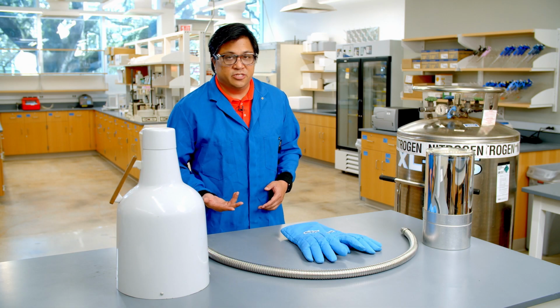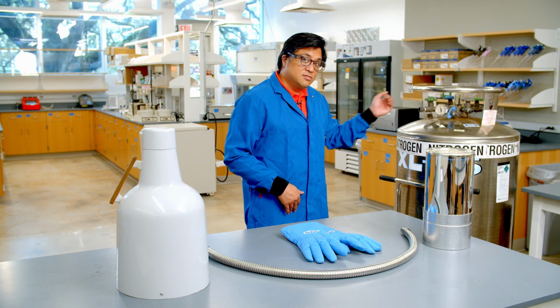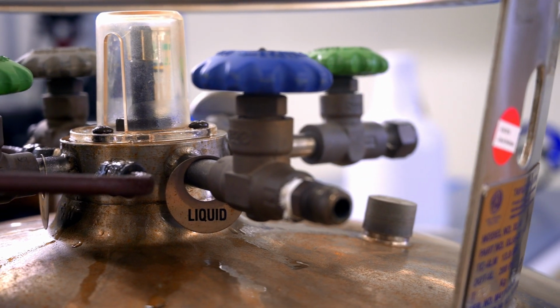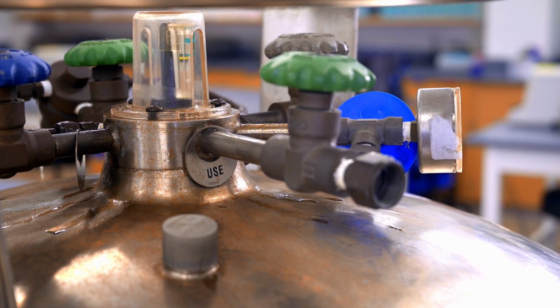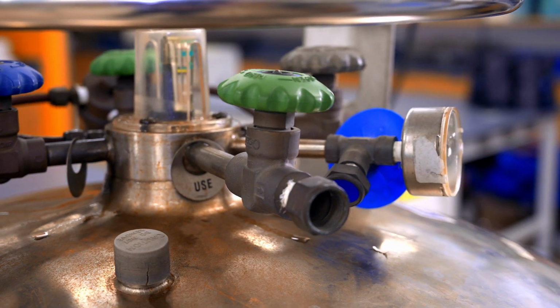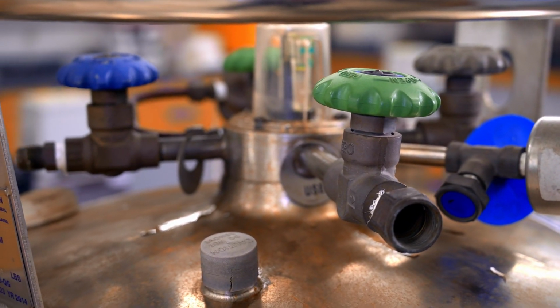Before using liquid nitrogen, take a moment to understand the equipment and the valves before drawing off your product. The liquid valve is used to dispense liquid nitrogen, which will be covered later in the video. The gas valve is used to draw vaporized gas from the dewar. It is advisable to use a pressure regulator when necessary to meter the pressure of the gas into your system.